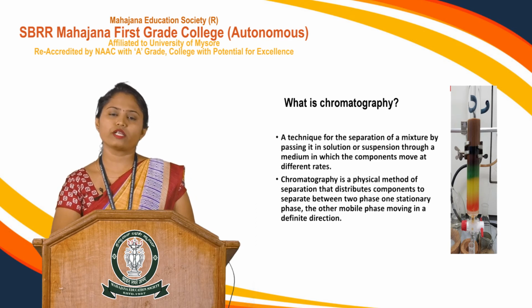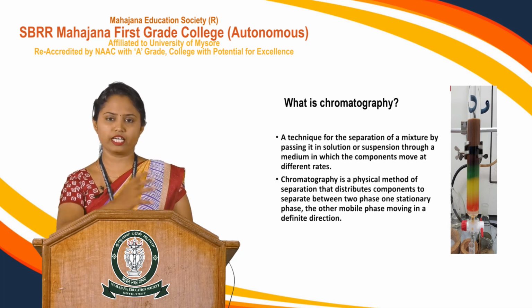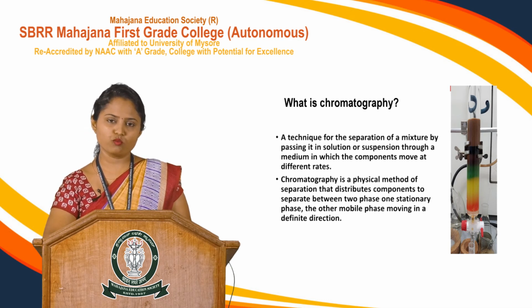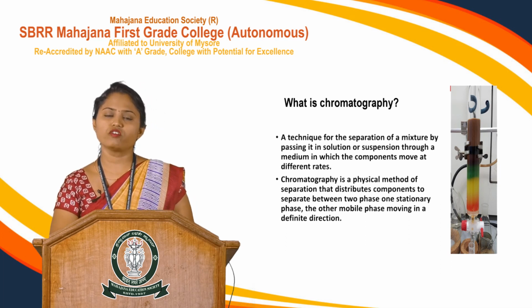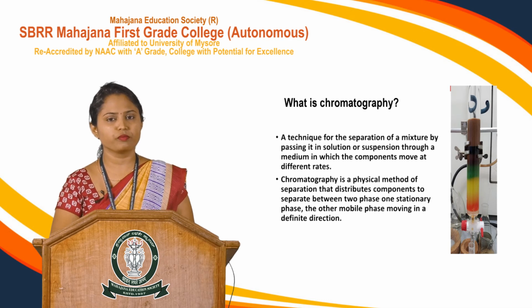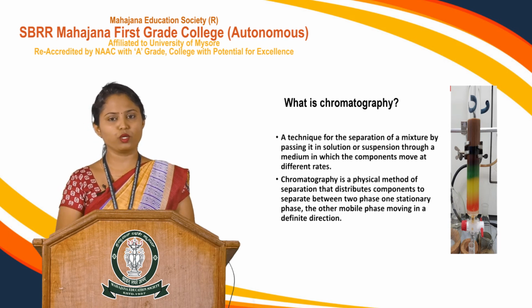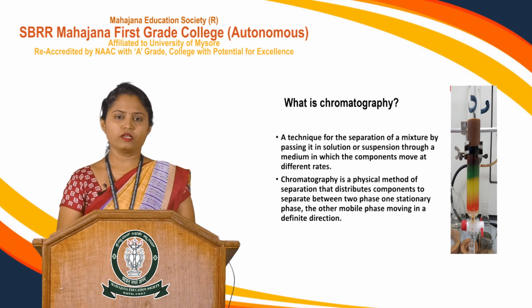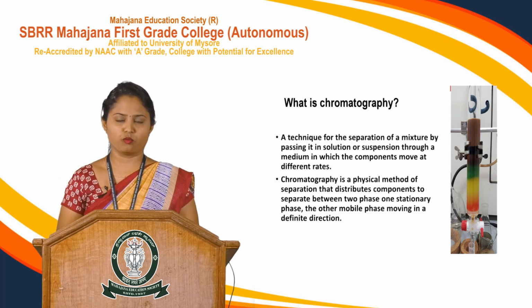So what does chromatography stand for? As we know, graphy is the application of a technique, and chroma stands for color. Initially the separation was based on color, on how the pigments got distributed, using the principle of partition or distribution coefficient. Based on different migration rates, the molecules get distributed between two immiscible phases and are isolated or separated. This stands as one of the major techniques leading to the separation of various biomolecules.